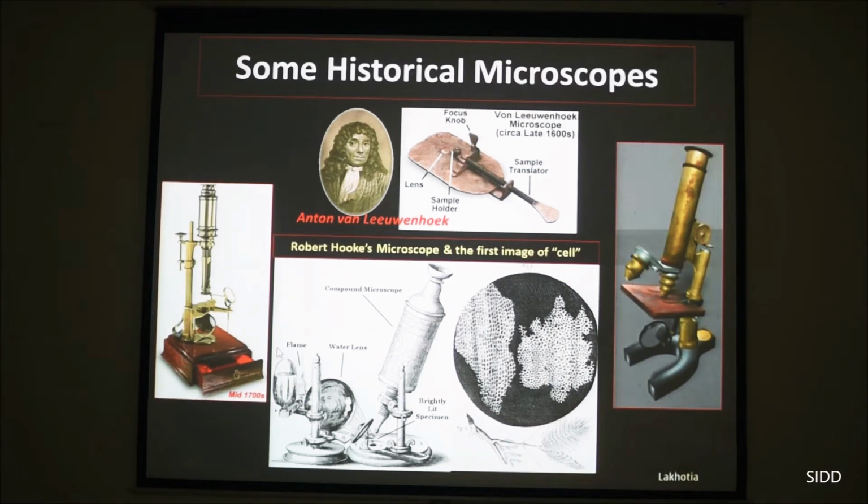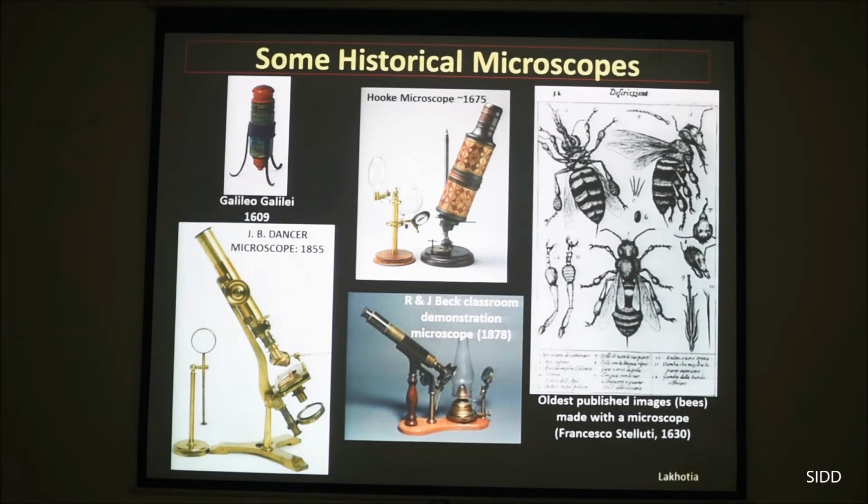Historically, remember, microscopes were objects of beauty as well. So they would be gold plated, they would carry various kinds of designs on their surface, a very nice looking box. That was part of not just utility but also a kind of aesthetic sense. So the historical microscope, for example, this kind of tripod microscope is characteristic of those manufactured in England.